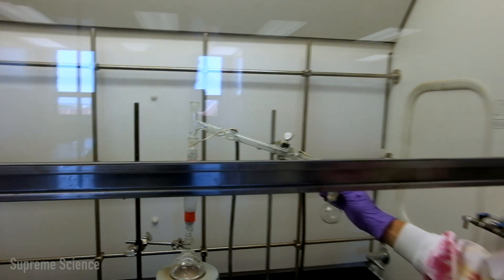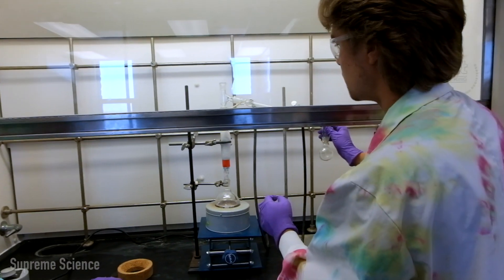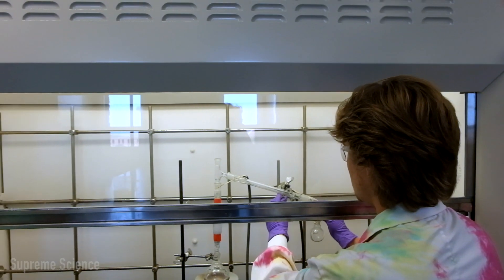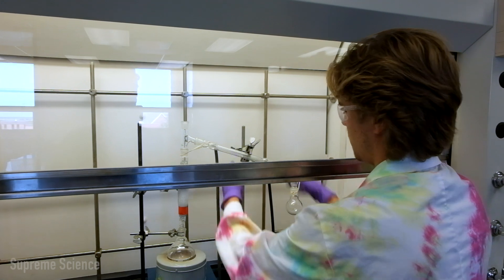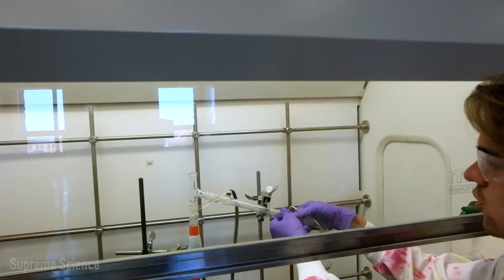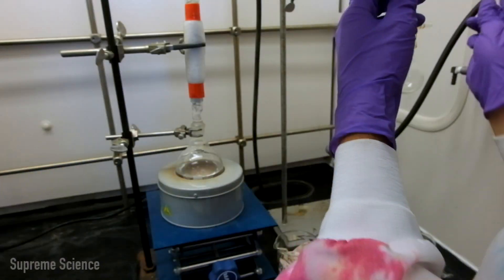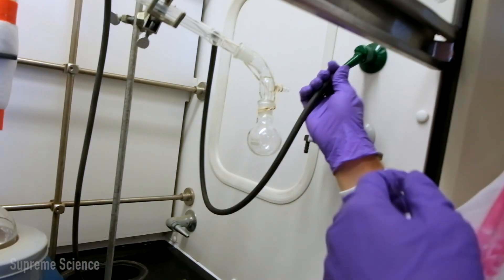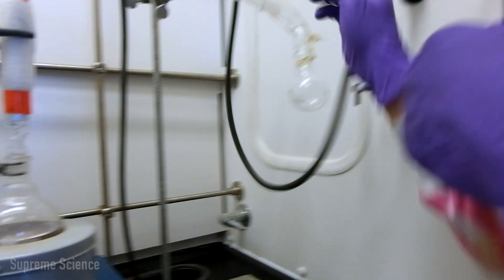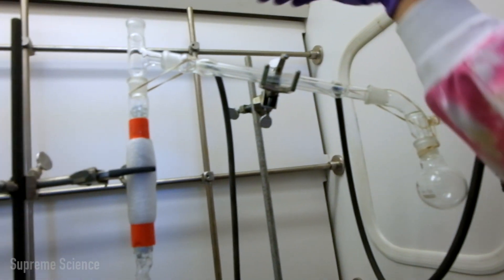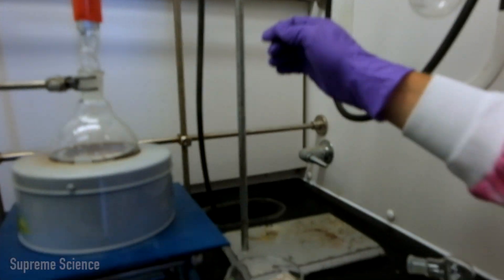We want to make sure that everything is straight, that the column's in a vertical position. Make sure that our clamp is supporting our condenser in the center. And we want to make sure that our tubes are pointing upwards so that the column completely fills with water. So we have the water connected from the water inlet to the bottom of the condenser, and then the top of the condenser to the drain.